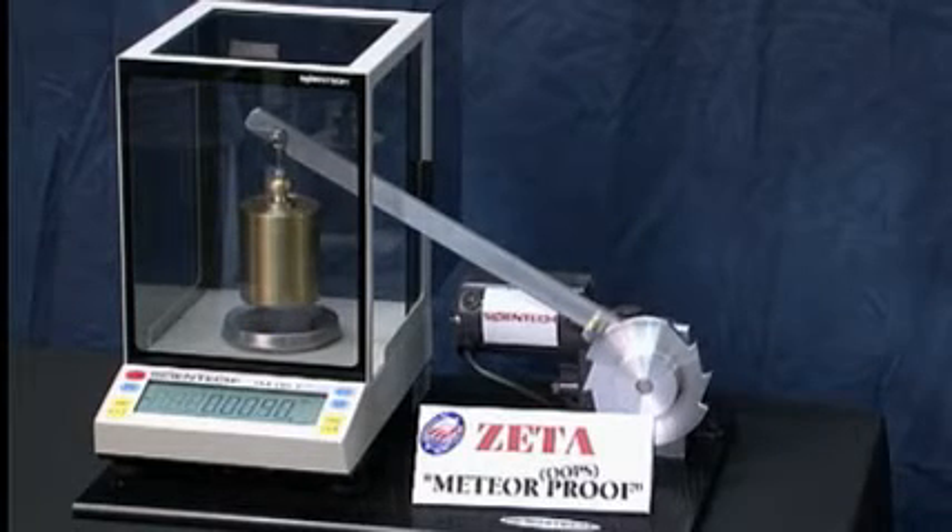We are dropping a 2 kilogram weight onto the weighing pan from a height of about 25 to 37 millimeters.